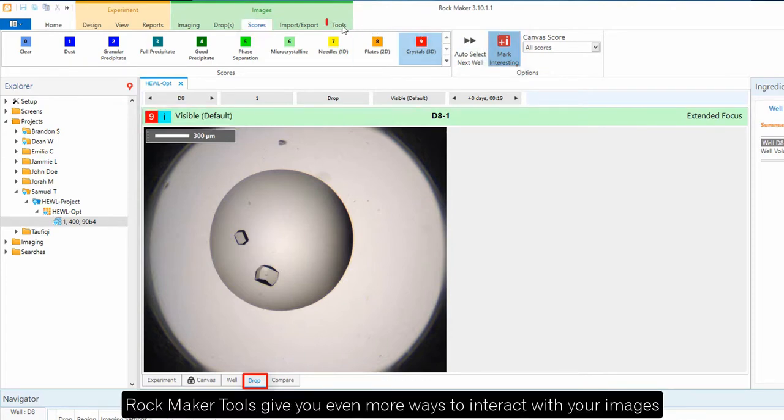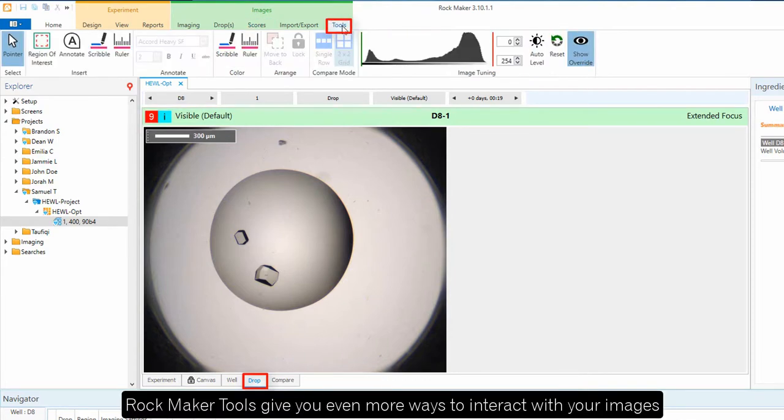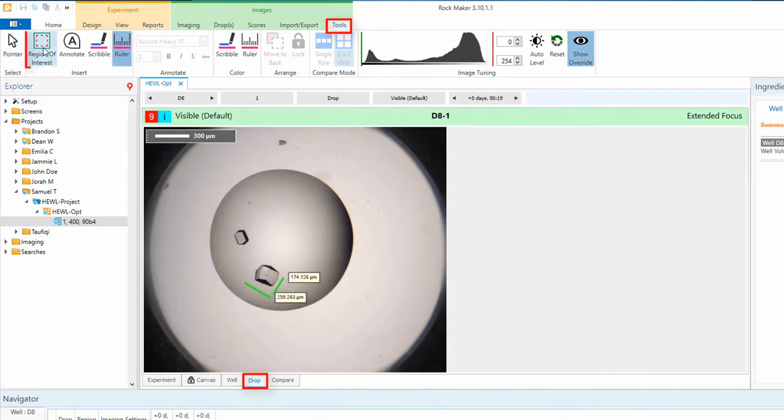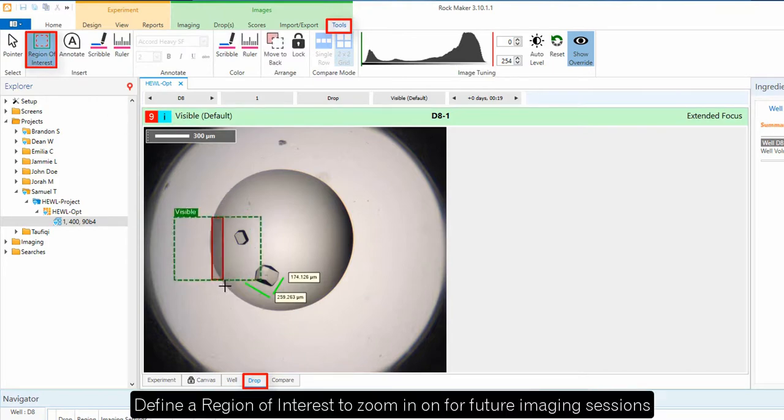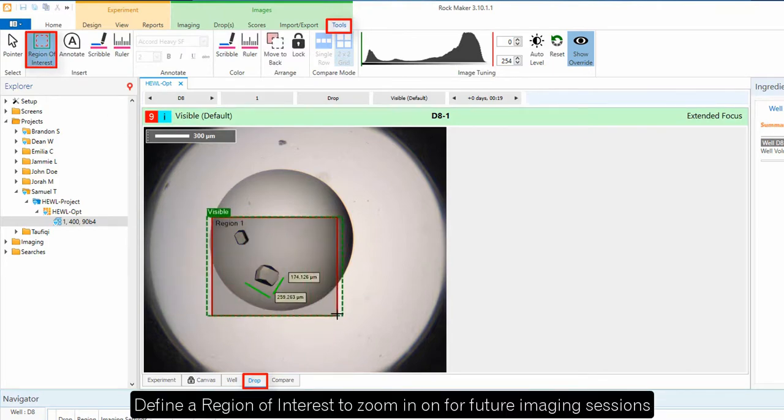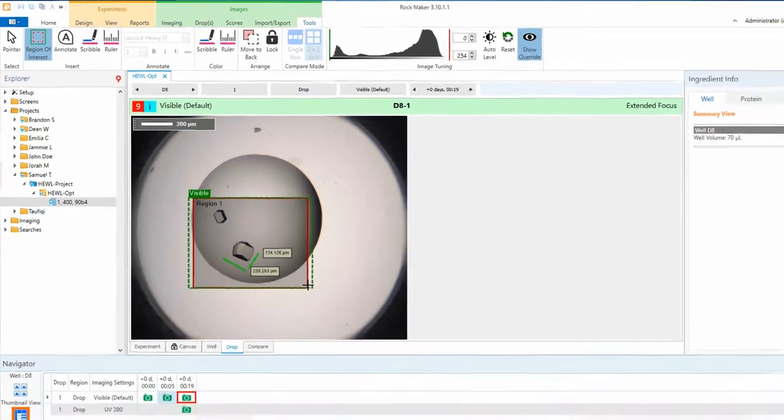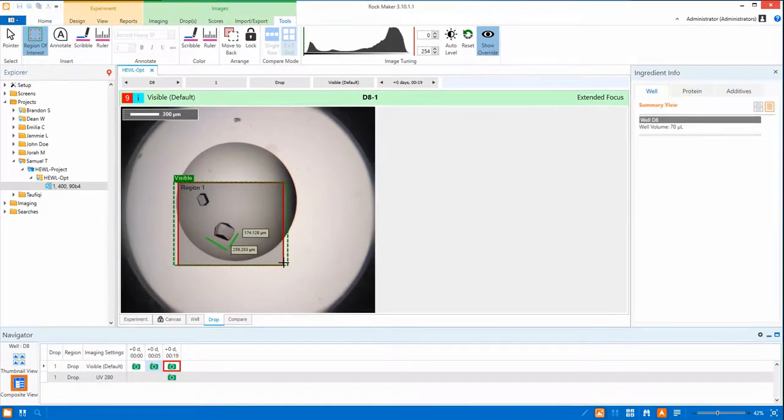RockMaker tools give you even more ways to interact with your images. You can take some quick measurements with the ruler and even draw a region of interest within a drop. This tells RockImager to optically zoom into that region during your next imaging session to give you crystal clear results.